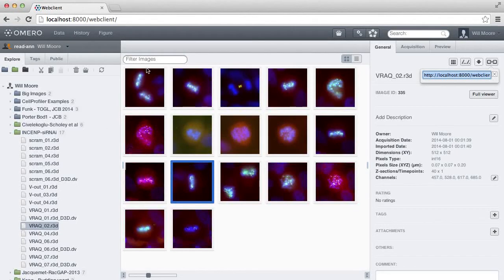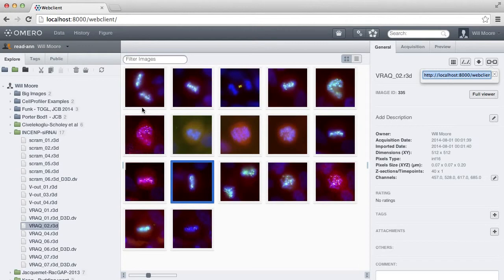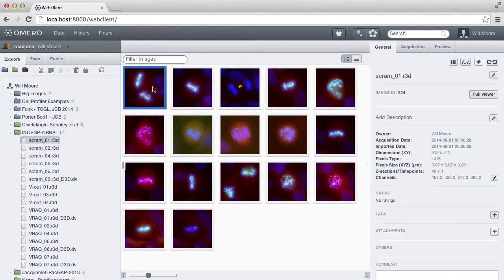Hi, I'm going to give a quick introduction to OMERO Figure, which is an application built on the OMERO web client.